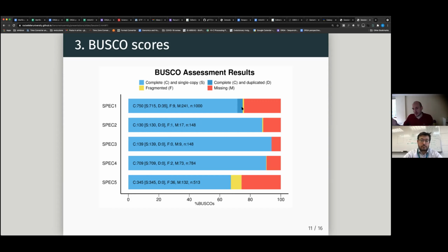The reason why these duplications are introduced in the first place is a whole chapter of its own, but basically the reads contain errors, and we know approximately what the error rate is. Sometimes the error rate is just by chance a little bit higher, so you get some reads that correspond to the same gene but, compared to a certain set of reads, have a higher error rate, and so they do not cluster together with those reads.